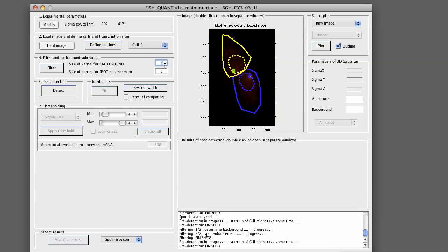We found that those values work nicely for our images. You might have to adjust them slightly for your particular images. We provide some tools to define optimized parameters for that. Please look at the help file if you find that these parameters don't work well for you.